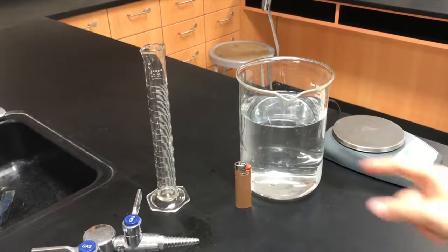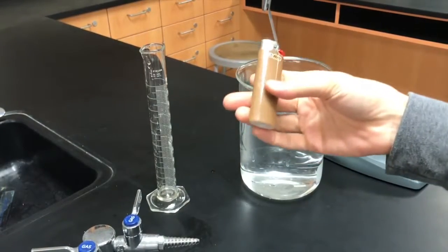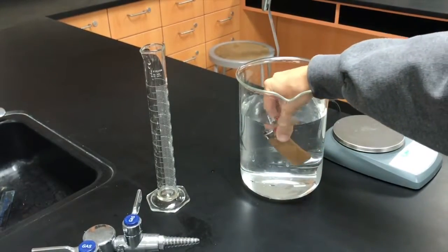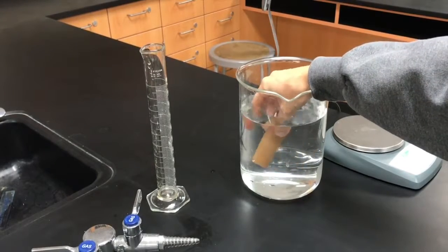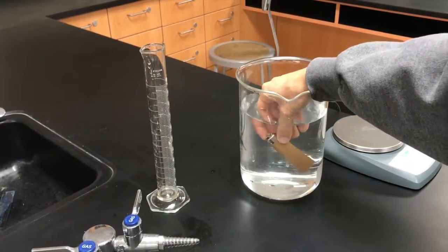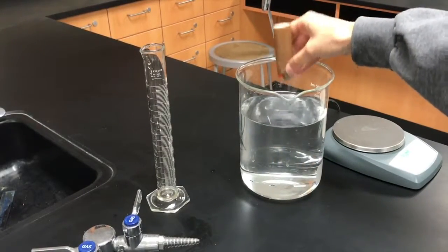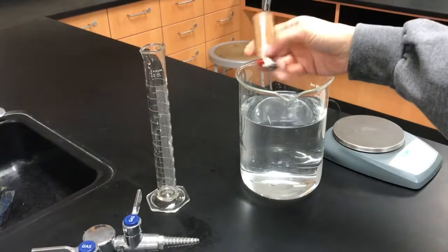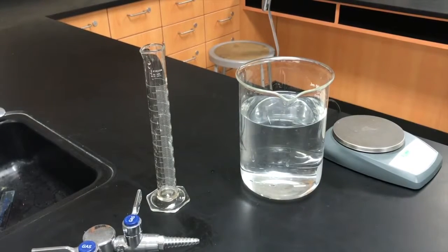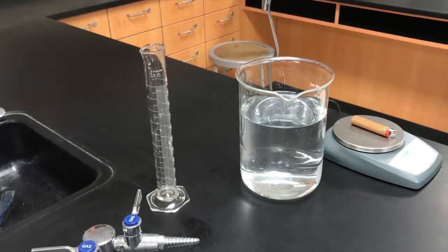So I'm going to take the lighter, and I need to submerge it in water, just to have it totally covered in water, because this is how it's going to finish at the very end of this lab. Okay, I'm going to take it out, and I'm going to grab a paper towel and dry it off. Okay, so it's being dried off right now. Then I can find the mass of it. So I'm going to put it on the scale, and I can find the mass of my lighter.